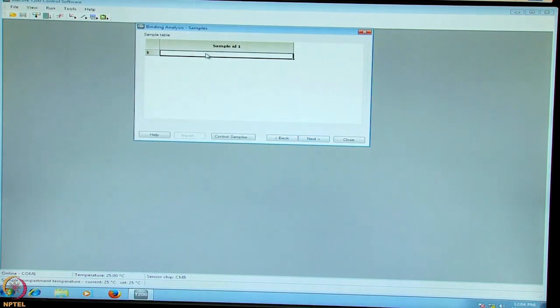Here we need to fill in the name of all single concentration compounds. So here we would select our analyte as beta-2-M. Just that we have one analyte, we will take it in three different concentrations. So we will name them as beta-2-M low, beta-2-M medium, and beta-2-M high.